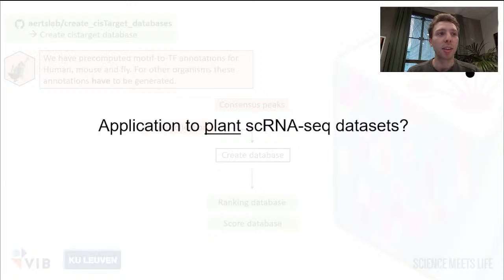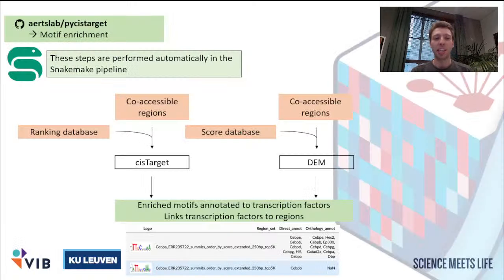Okay, and with this, we go to the last step, which is the actual GRN inference. And for this, I give the floor to Darina, who is sitting next to me. Yes, so I will explain briefly how we run SCENIC+.